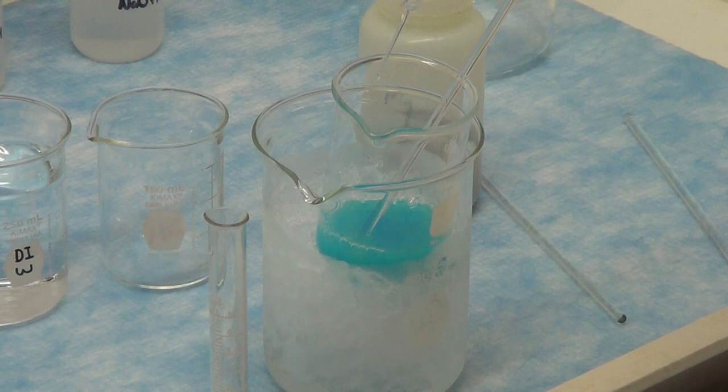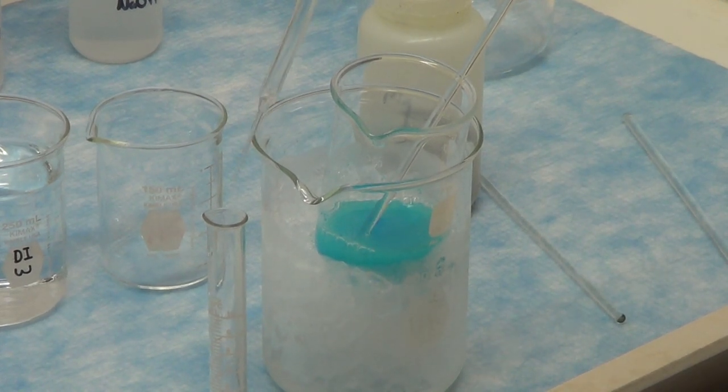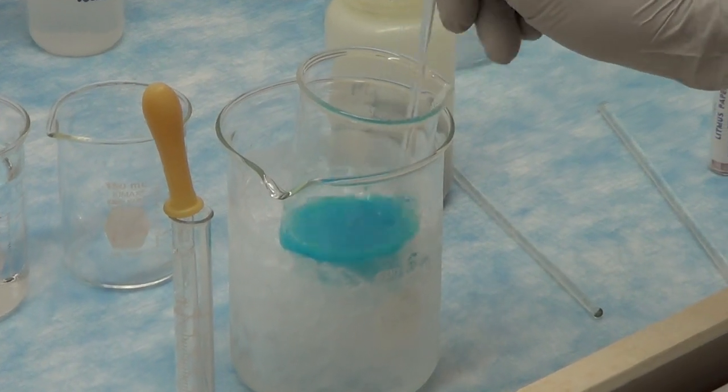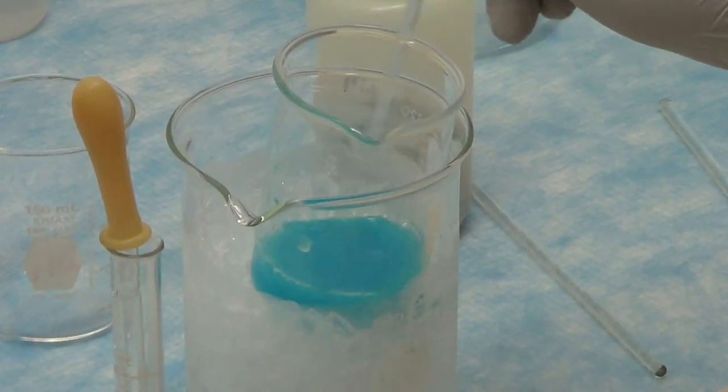The blue gelatinous precipitate that forms is copper hydroxide. The precipitation of copper hydroxide is not complete until the supernatant liquid is basic.